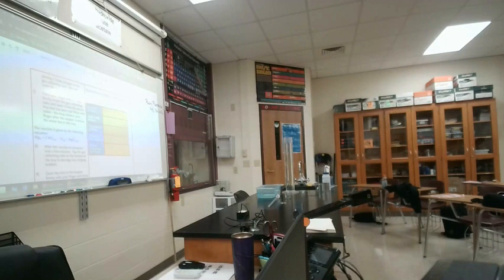How are you guys? Is this the magnesium ribbon? Can I have your magnesium ribbon real quick, please? Thank you very much. All things look good, yeah. Hopefully that'll work for you. There you go. Mr. Brand, how do I make this little cage thing? Well, first of all, you have to bend the magnesium ribbon in half twice, otherwise you can't make the cage around it.